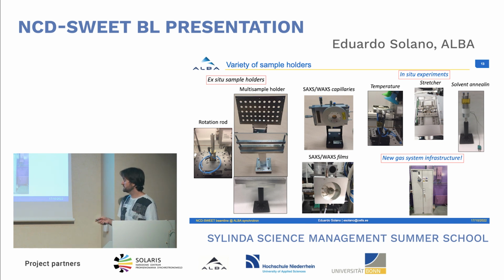And for in situ experiments, we have different Linkam stages, couple for capillaries or for films or for grazing incidence mode. We can have a stretcher to stretch the sample at the same time that we are heating it up, and we can record the scattering pattern. We have solvent annealing systems. We have a shear cell that I don't have a picture of now. And we recently have a new gas system infrastructure to expose our sample to different gases and different conditions. So we are working more into the catalysis field.